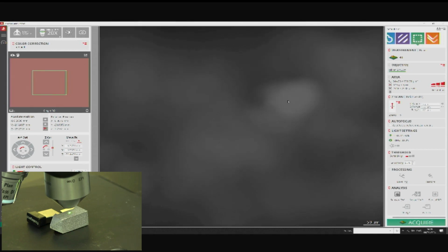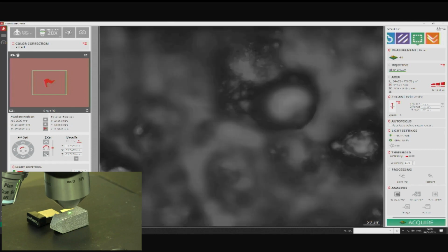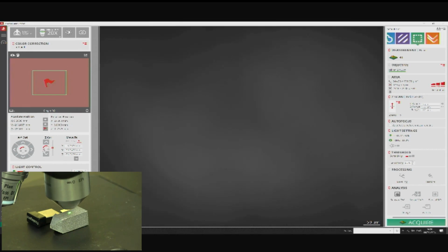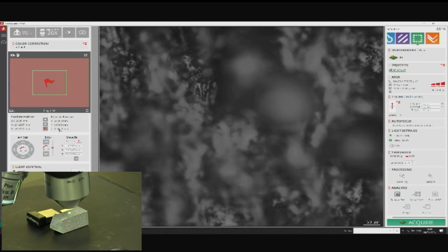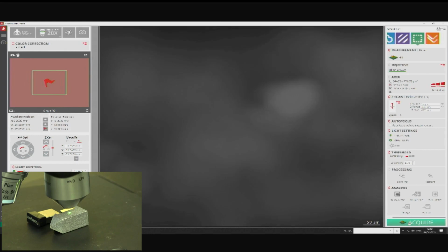The top of our sample is starting around this area. We're going to drop down by the amount where we've passed through it. So if I just come up to the bottom, just to about this area here, we've traveled 300 microns. I'm going to travel 400 just to be safe. So I'll come back up to my Z0 position. We're just going to click acquire.